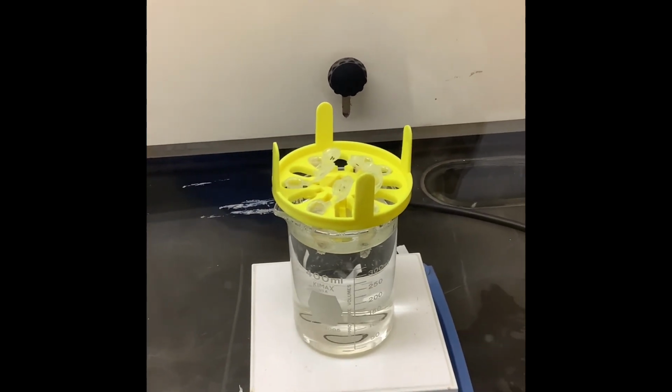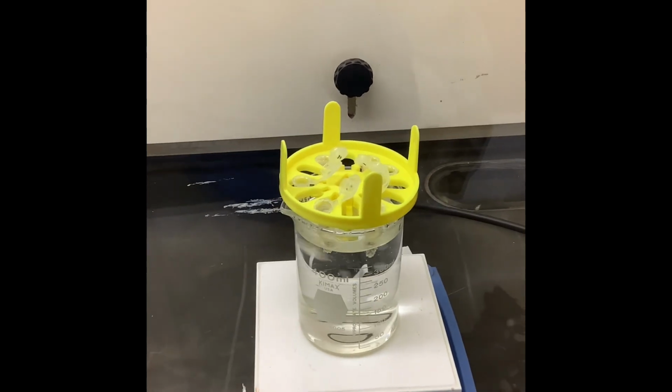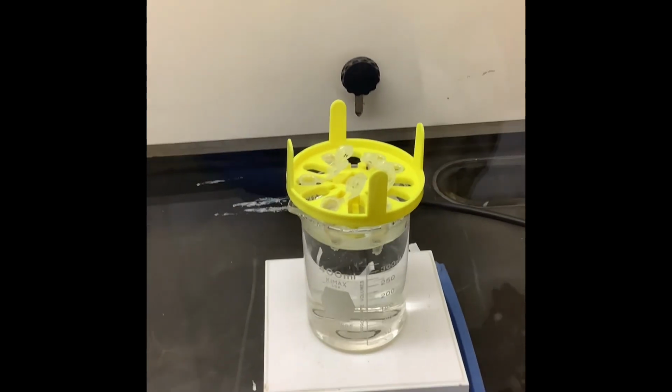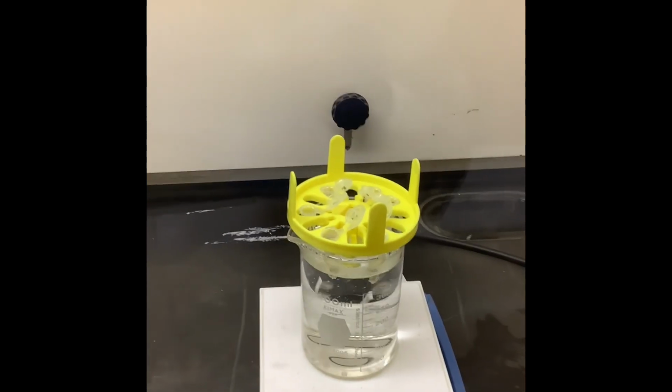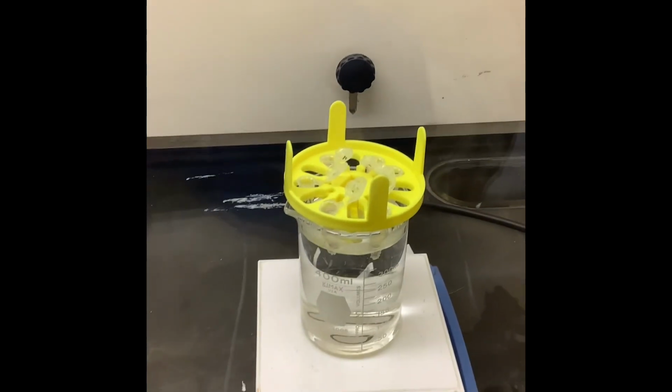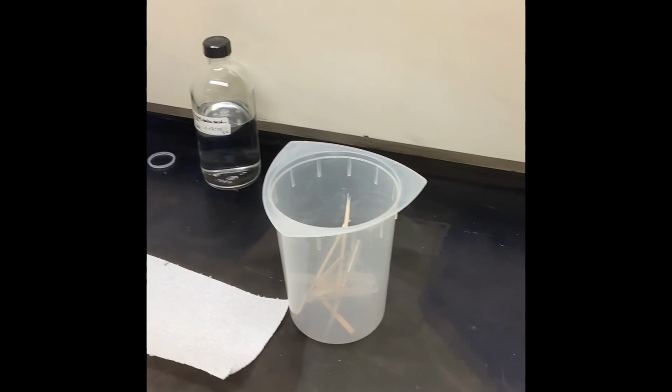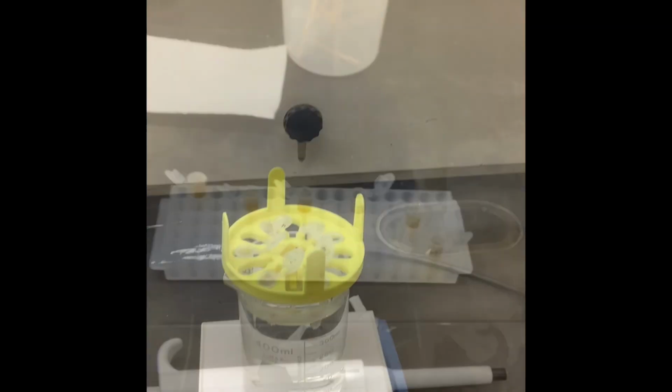I also wanted to mention that when you're stirring the samples before the water bath with the wooden stir stick, make sure you're using a new stick for each sample, and make sure you're treating that stick as chemical waste, so it's going to go with all your pipette tips, and those are all going to be properly disposed of at the end of the procedure.